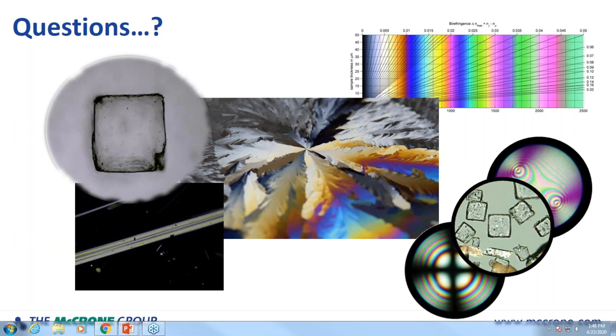And it was either earlier this year or late last year, I actually worked with a conservator out of the Museum of the Rockies looking at T-Rex bones and looking at the pyrite, which is in the mineralized area of the T-Rex bone, to try to determine why it was degrading as quickly as it was. Iron pyrite, there's two types. One is high in sulfur. So we were actually using polarized light microscopy to look at biological samples.